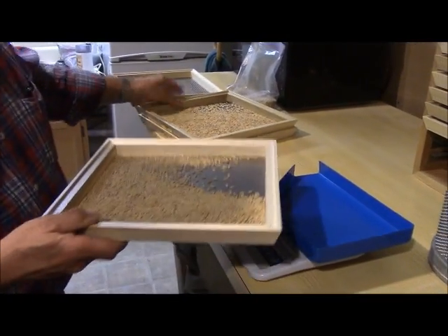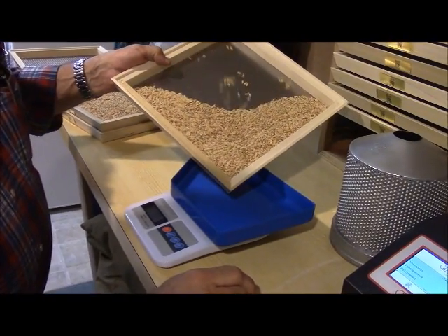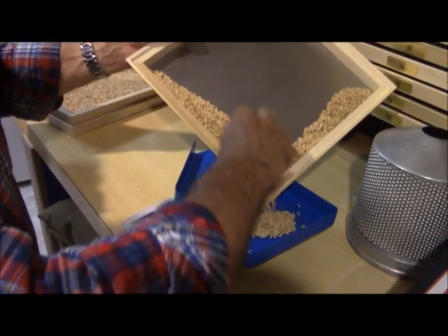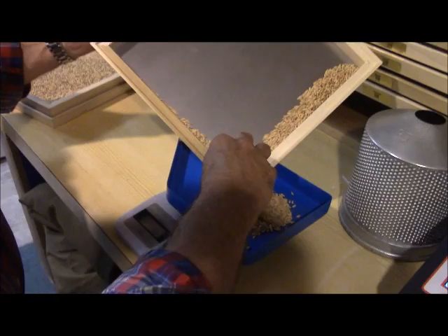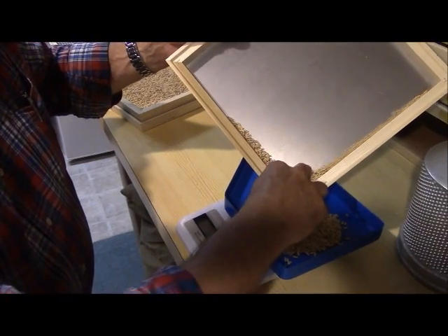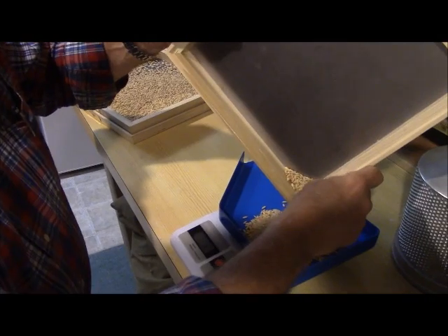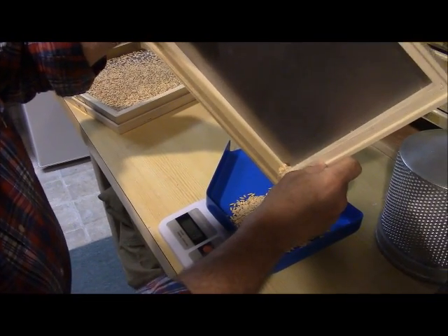We're now going to weigh out a 100-gram sample to run through the PAZ1 mill. Then we're going to evaluate both whole rice and head rice. Following that, we're going to get an evaluation on the whiteness meter for the degree of bran removal that we have achieved.